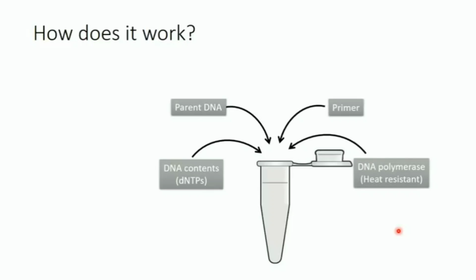Now in real-time PCR, we need one extra molecule, which is very important, and which is the detector. The detector is the thing we use to detect.